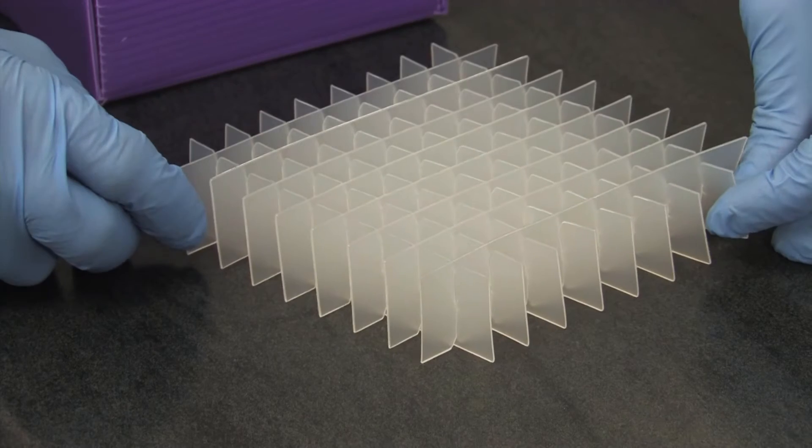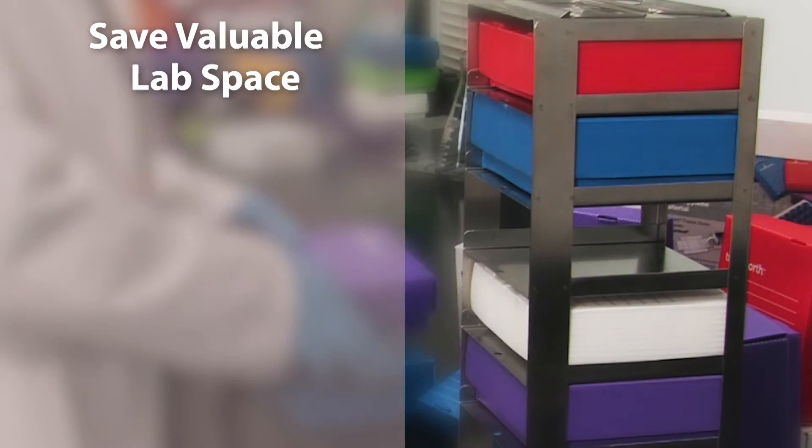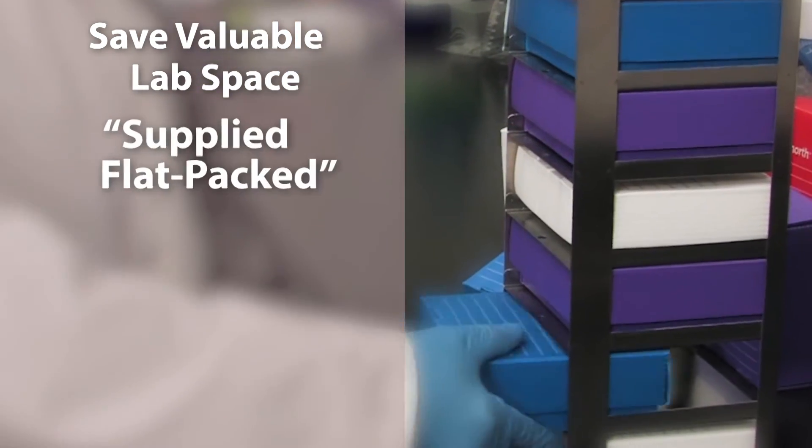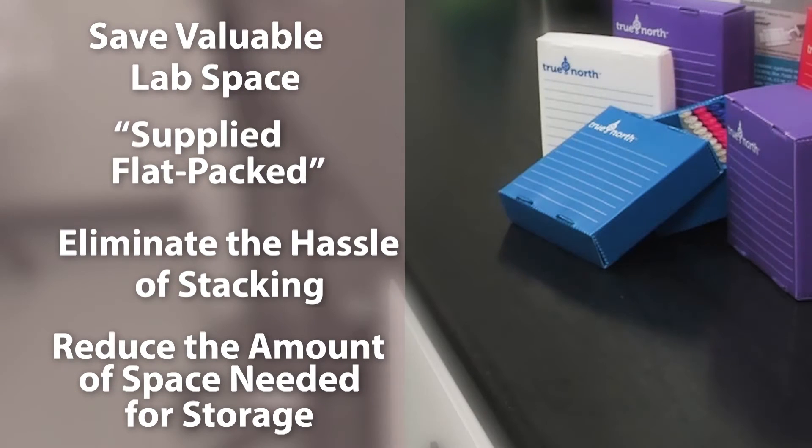When ready to use, assembly is easy and pre-assembled dividers are included with each box. When it comes to saving valuable lab space, True North flat pack freezer boxes are supplied flat packed, which eliminates the hassle of stacking and reducing the amount of space needed for storage.